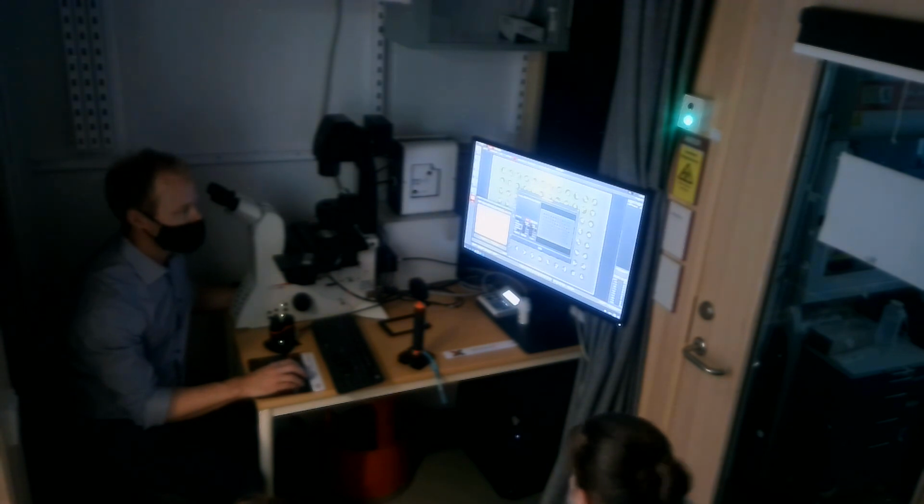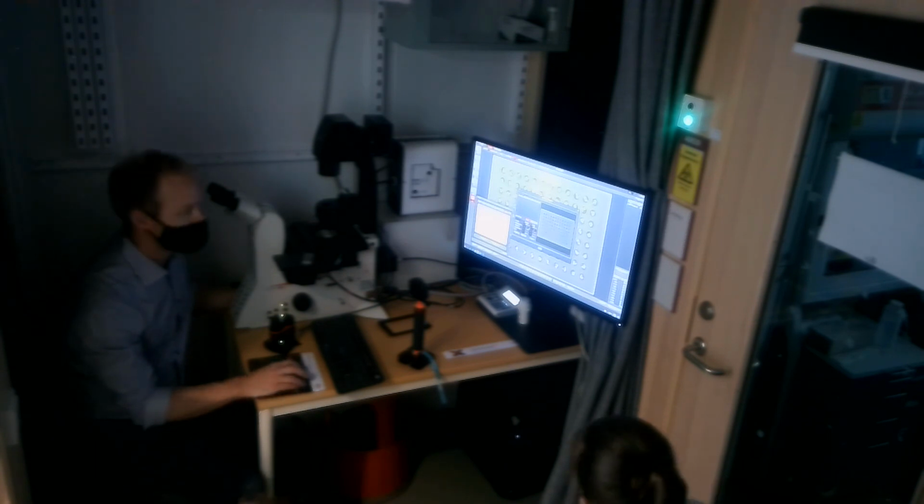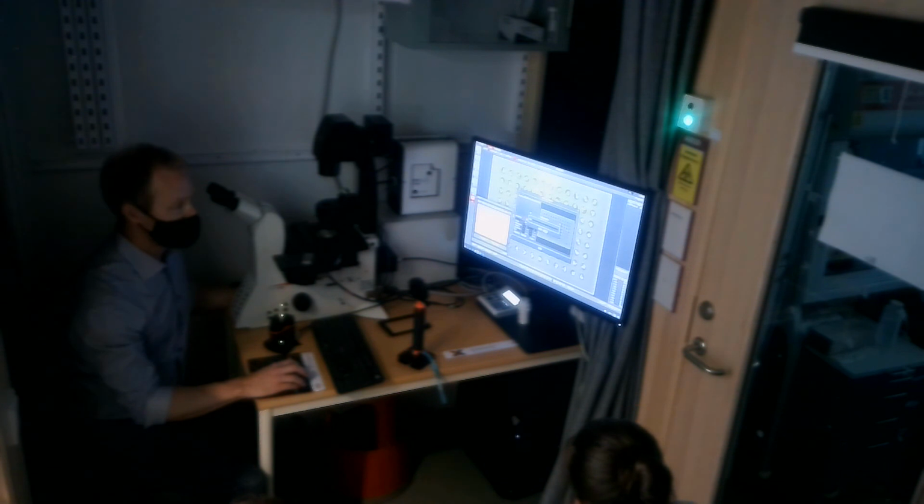All of this data is typically available from the manufacturer of your plate. So you find that on websites or something like that. So then you just plug that in here, and that then is fine. And once you have that, you just go save as. You call it something that makes sense, the plate and the number of wells typically, and that's it. And then that would be available.